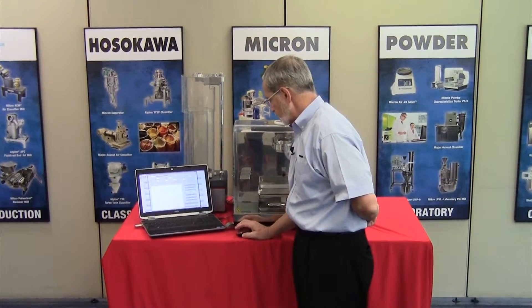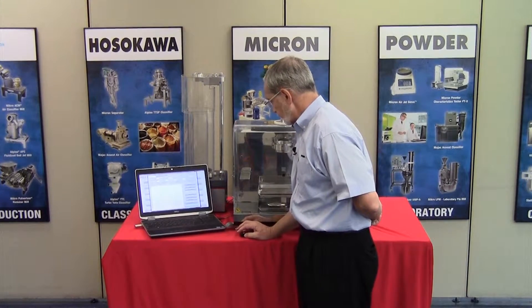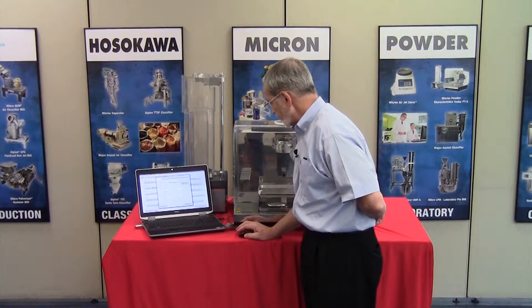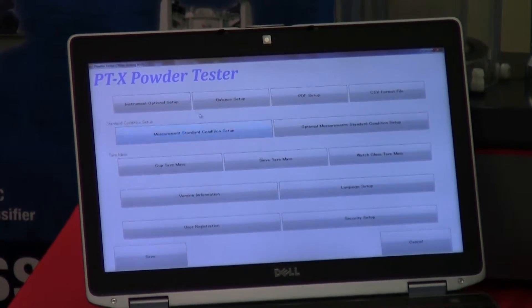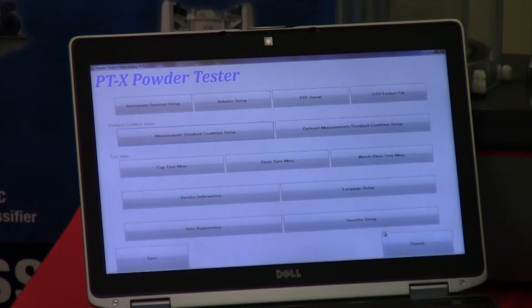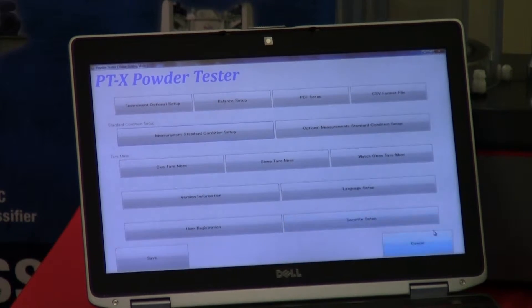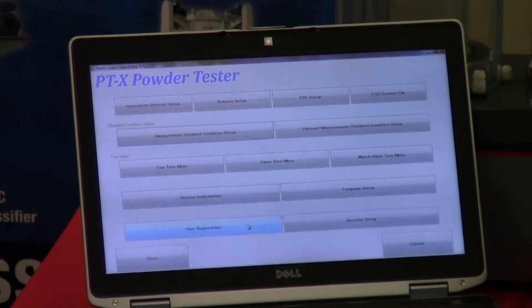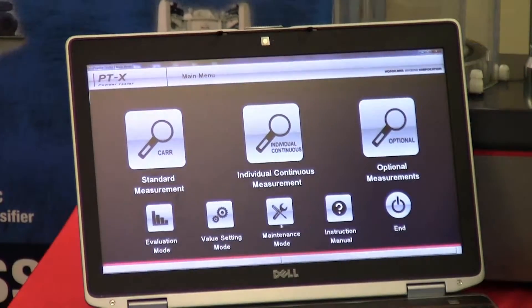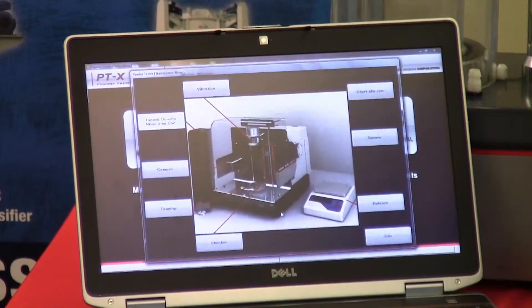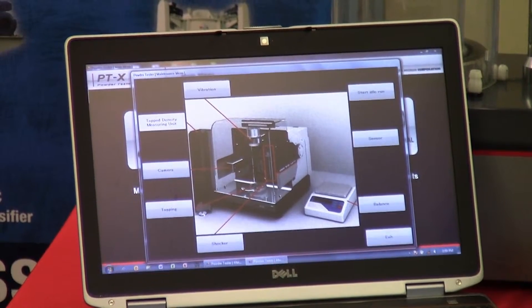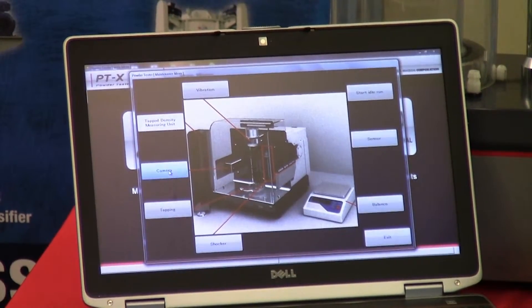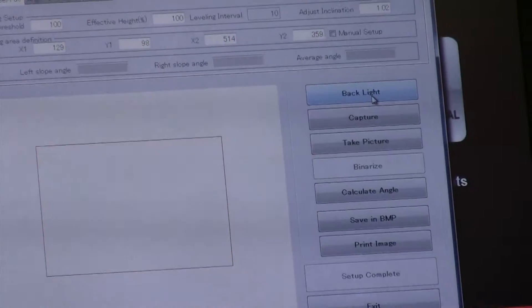That too will be covered in more detail in another video. There are other areas within this window that we can go through for setups and security measures as part of the initial setup. I'm going to bypass that for now. In maintenance mode, provided your equipment is communicating properly, let's take for example the camera — we can go into the camera.